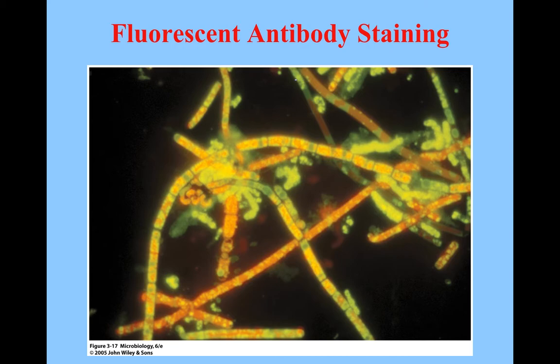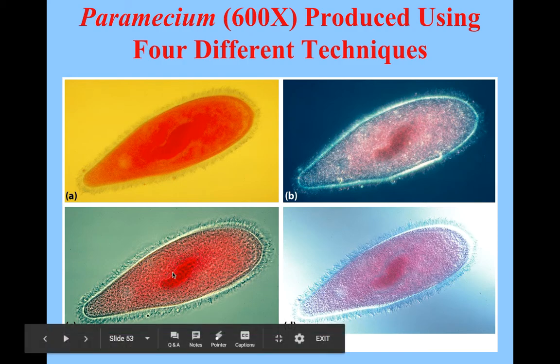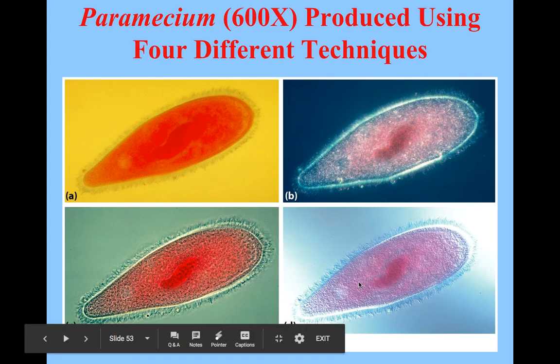Again, a special condenser. Now, these are the same object, a paramecium, with the 4 different techniques: bright field, dark field, differential, and phase contrast microscopy.